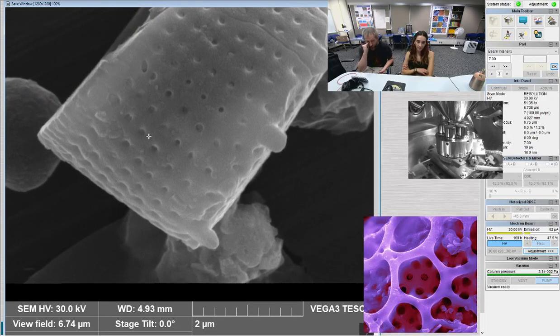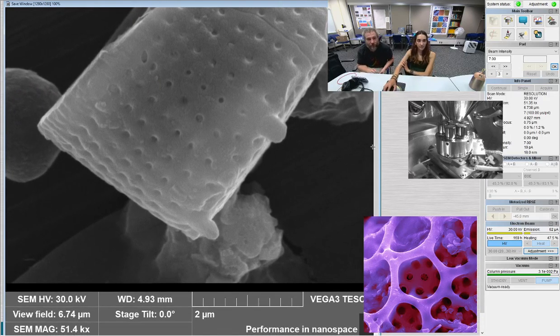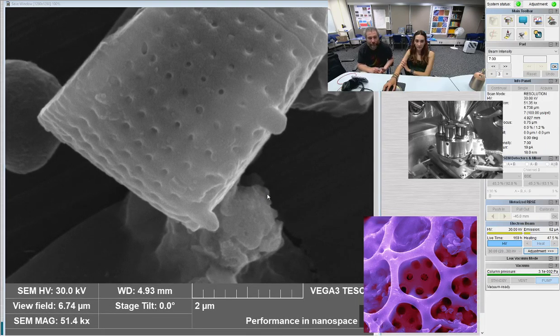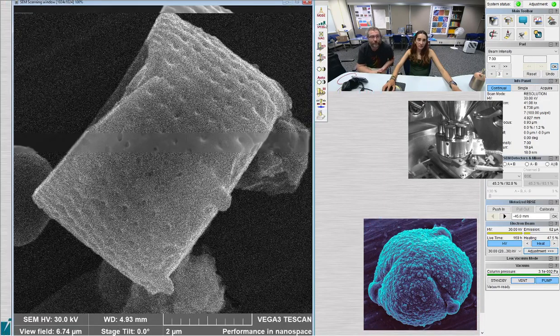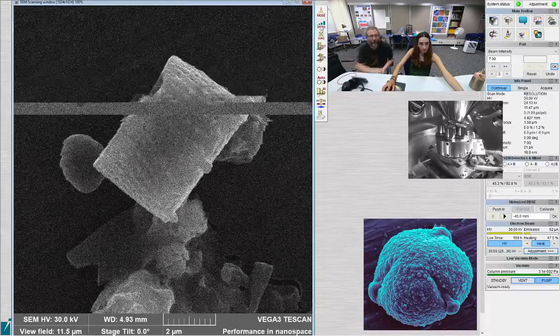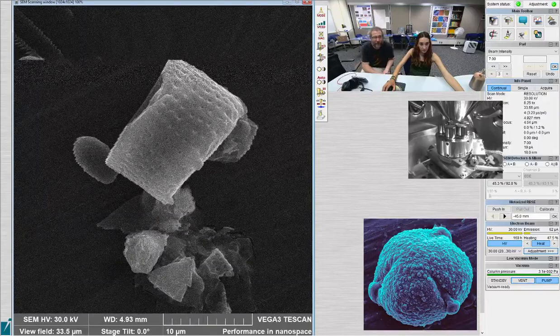There are also some tools you can use to sort of spotlight where you were on the slide, but people usually start by putting that on there. When I'm doing it, I don't actually have a very good diamond scribe. I have a very old one. So I usually just start with a Sharpie, and I just jam a Sharpie down on the cover slip, close to, but not on top of, the sample.